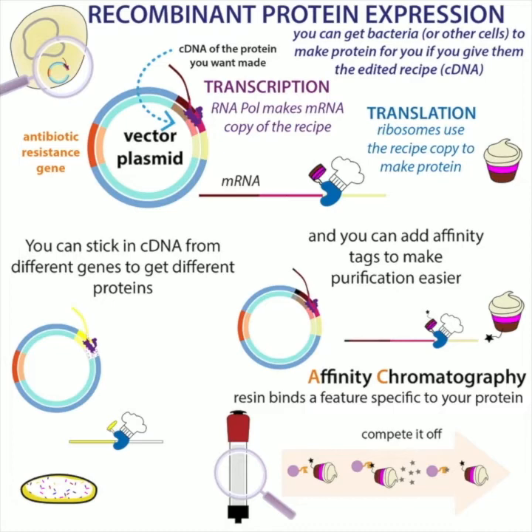I'm going to talk more, but basically this is showing it from our point of view. The stage after expression is kind of complicated, because there's the actual expression: the transcription of the DNA into mRNA, and then the mRNA being made into protein.